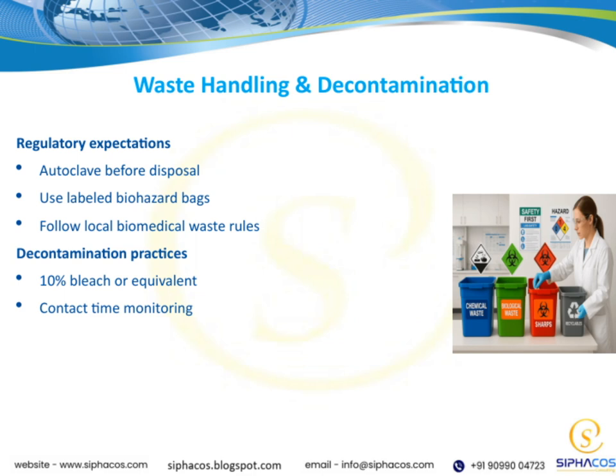Regarding decontamination practices, a common method is using a 10% bleach solution or an equivalent disinfectant. This helps to inactivate any remaining pathogens on surfaces or equipment. Remember, proper contact time is key. Monitor how long the disinfectant stays on the surface to ensure it's effective. By adhering to these practices, we not only protect ourselves and others, but also ensure compliance with safety standards. This is all part of the larger goal of maintaining a safe, clean, and responsible working environment.